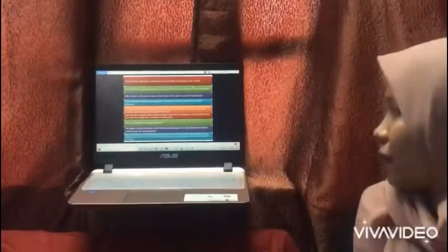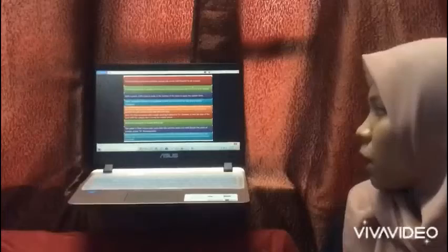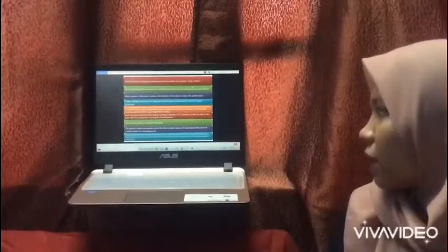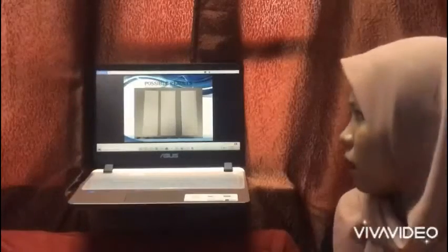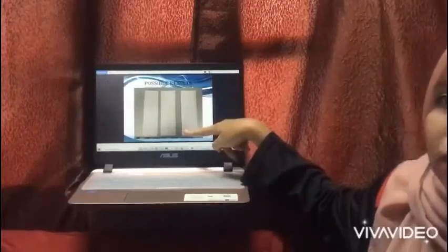Then remove the plate and allow it to dry. The sample spots can now be seen in a suitable UV light chamber or any other methods as recommended for the sample. This is the possible result that we may get. There you can see that there are a few spots here.